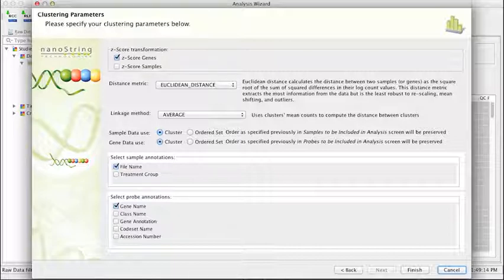So z-score transformation corrects the data internally within a single experiment, and values for individual genes are expressed as a unit of standard deviation from the normalized mean of 0. Correction is done before sample-to-sample comparison. Comparisons across samples across experiments are then performed on equivalently transformed data, and changes in gene expression are then expressed as differences between z-scores. Using this approach, gene expression data derived from different studies becomes comparable across experiments and across labs. So this is usually done with genes. We do provide you the option to use your samples, but this is a very different type of experiment that you're doing.